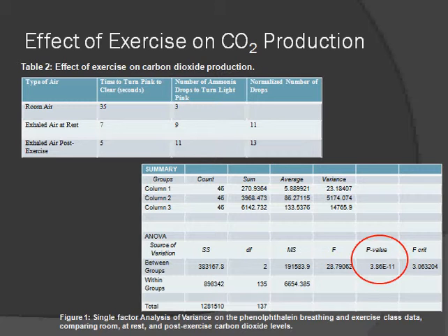In comparison, there was less carbon dioxide in the pre-exercise air, thus requiring fewer drops of ammonia to turn the solution back to its original pink hue. Therefore, as predicted, post-exercise air contained more carbon dioxide than pre-exercise air.